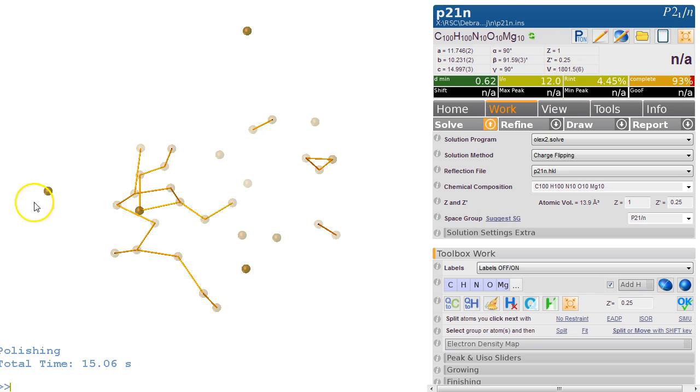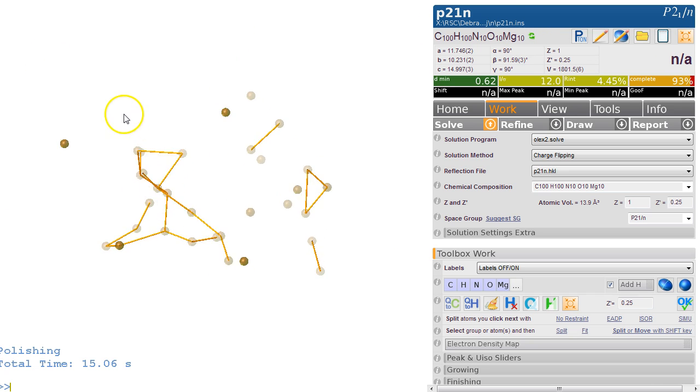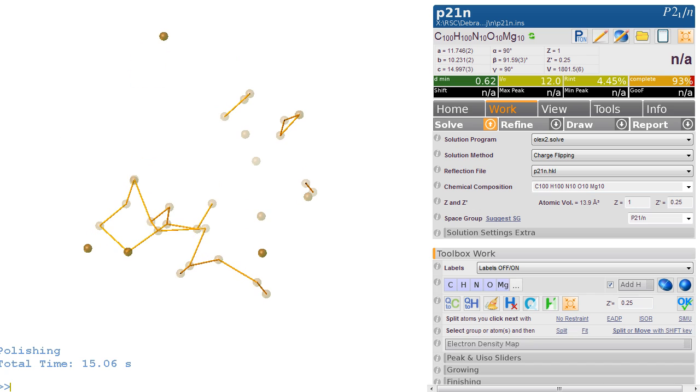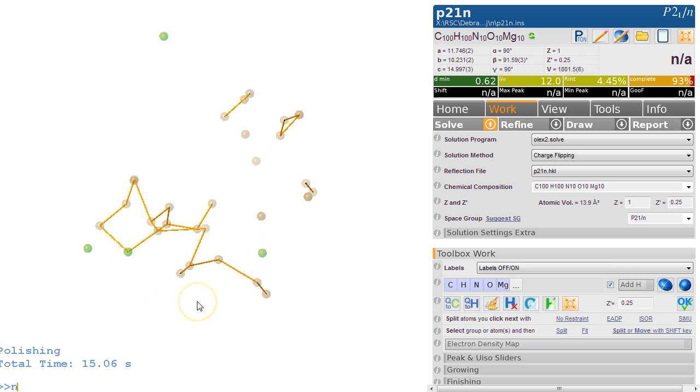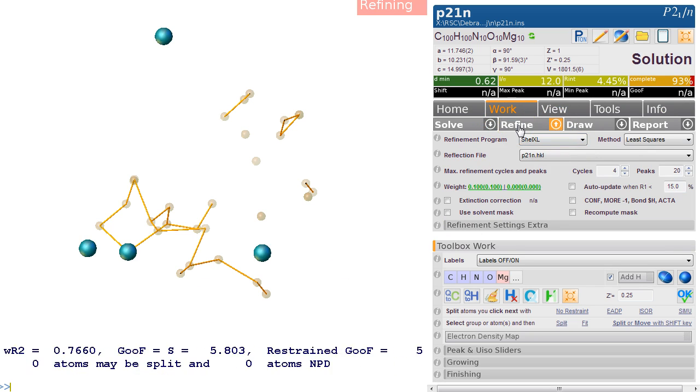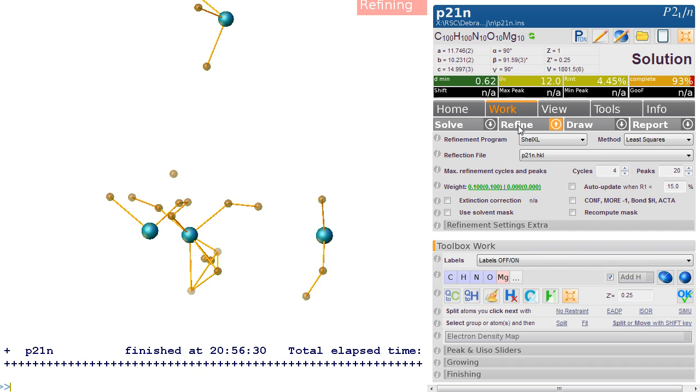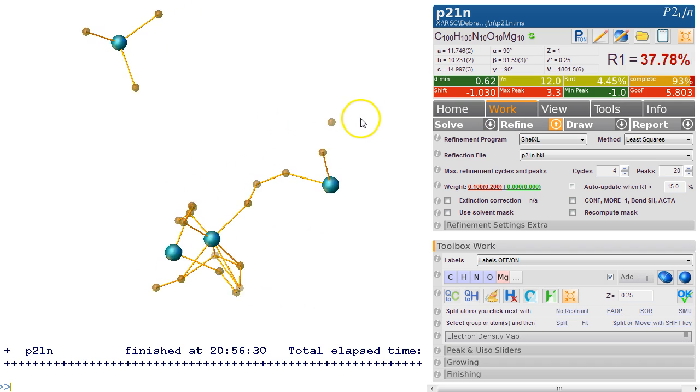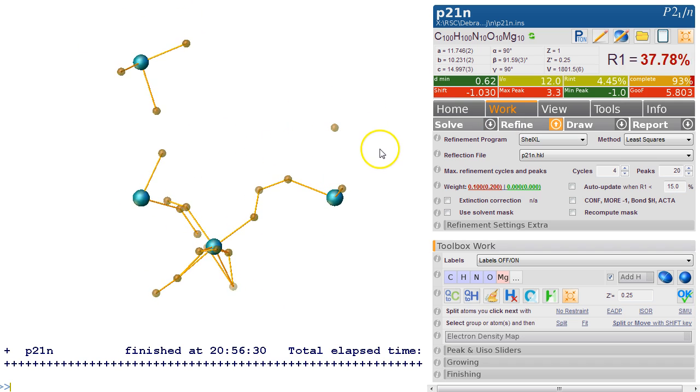We notice possibly magnesium in there. So what we'll try to do is just select these heavier things as magnesium, and we go 'name Mg' and just refine it and see what we get. So this looks not bad.